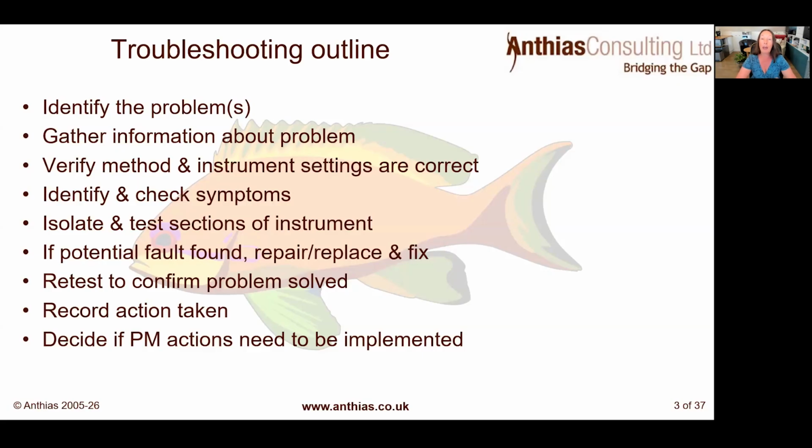So 90% of problems are caused by what was last done to the instrument. So either that's a sample analysed or maintenance performed. And of course, that also includes troubleshooting. And decide if any preventive actions need to be implemented to prevent this problem happening in the future.